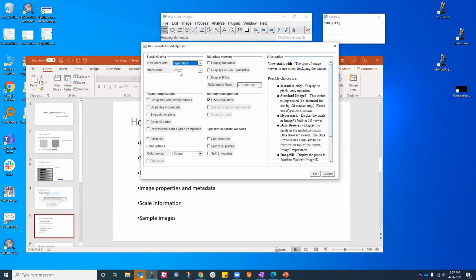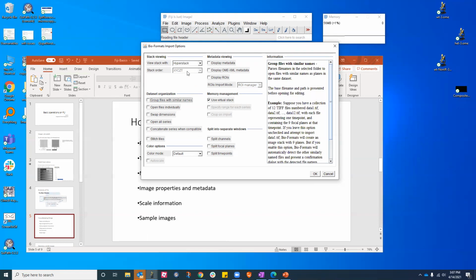Below that, if you have a Z stack, there will be one more slider below the channels bar, which will allow you to change the Z stack. And below that, you can have one more slider bar, which, let's say if you have time-lapse data, you can also scroll through the time, okay? So that's essentially the organization of how your image is going to be.